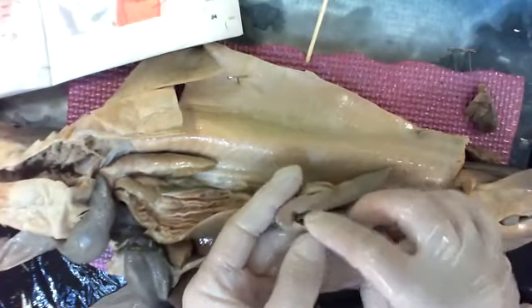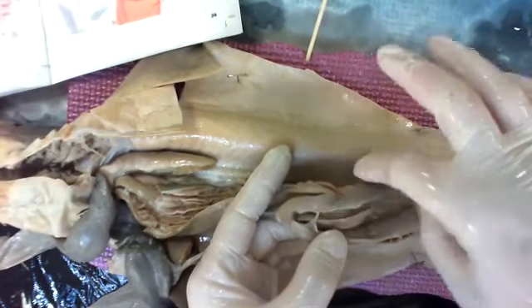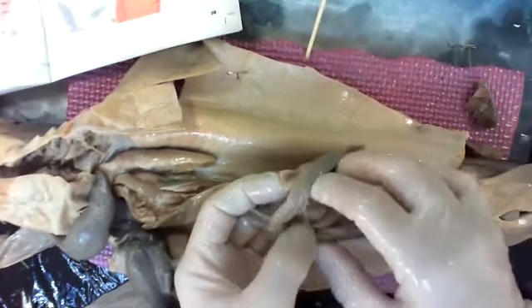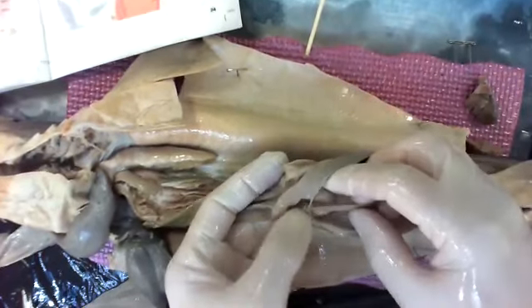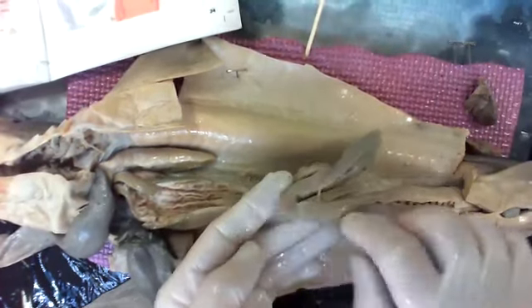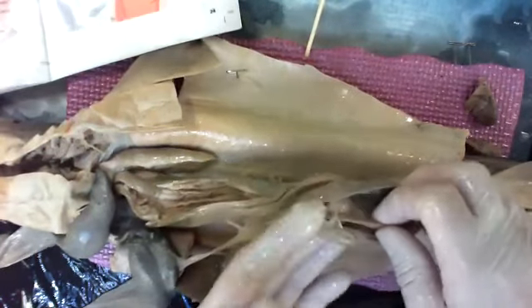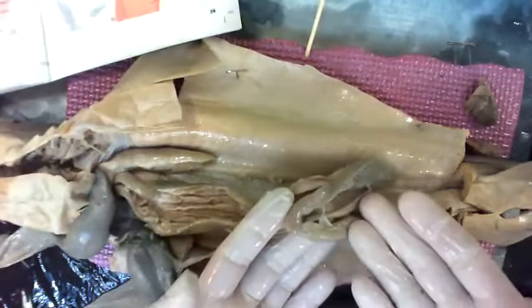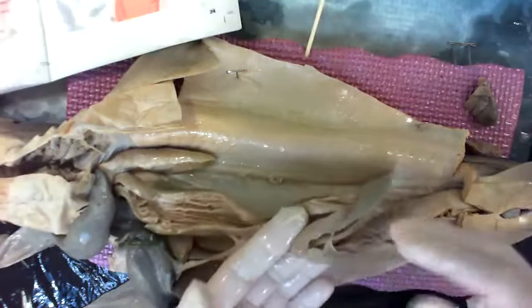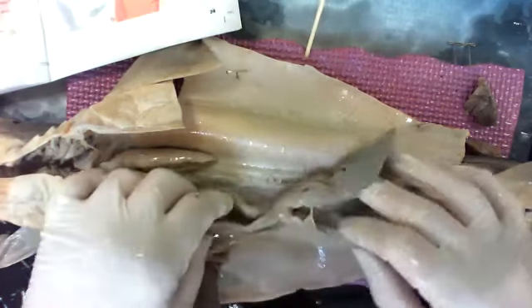There's a little piece of pancreas, not little, it's actually big, that hangs off the back here too and comes down. Not the spleen, that's the spleen over here. The pancreas is hiding right there. See it on my fingers? That's all pancreas too. The other thing the pancreas does besides helps you digest food is it releases a hormone called insulin that helps you regulate blood sugar. And if it's not being produced properly or not working properly, then you get diabetes. So that's where the pancreas is really well known.